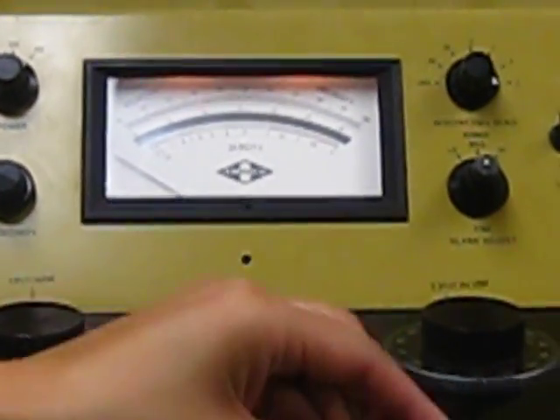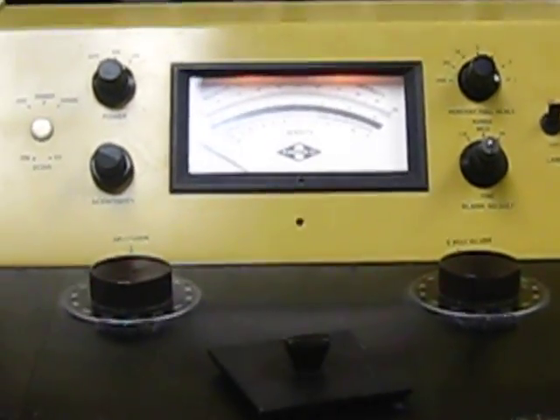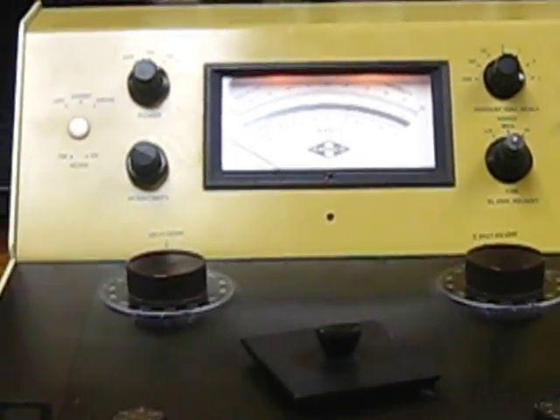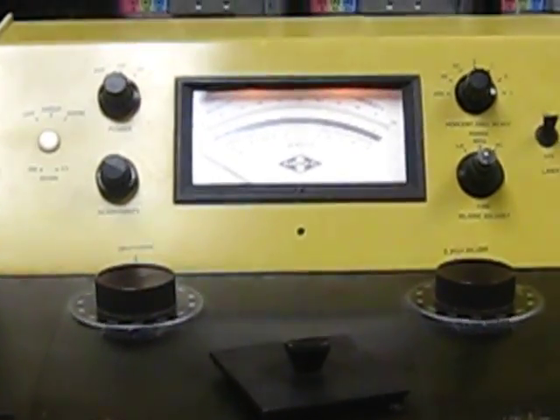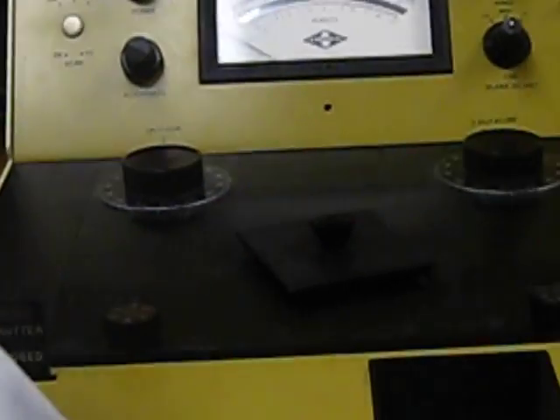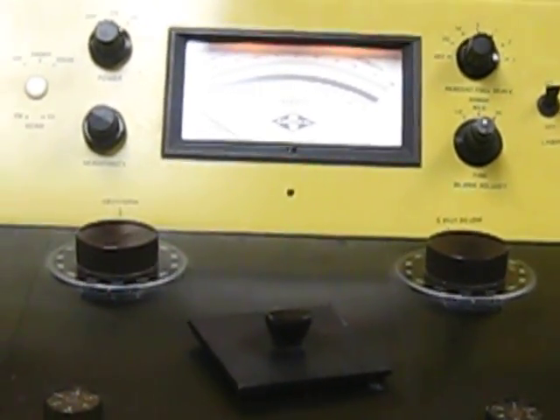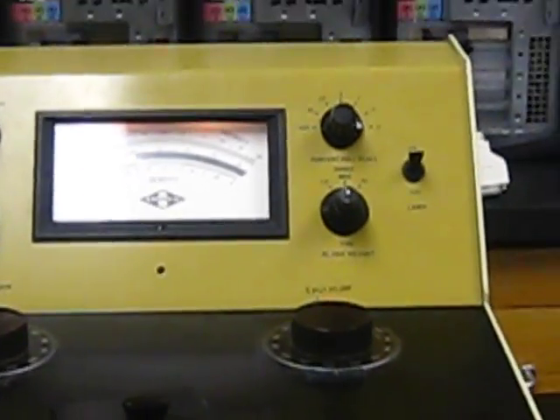Now you can set the wavelength with any tube, right? Theoretically we can set it with any tube, but we want to use the one with the highest fluorescence. So we just pick this one. So we put the first sample inside.